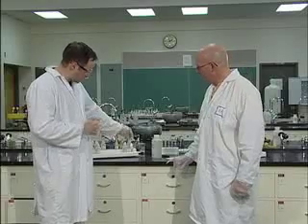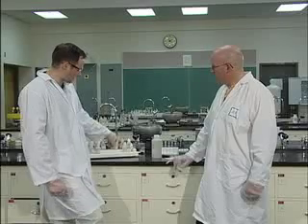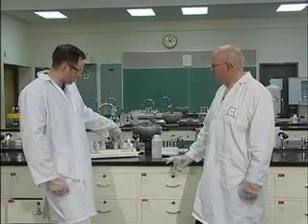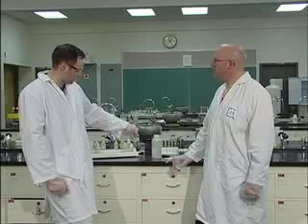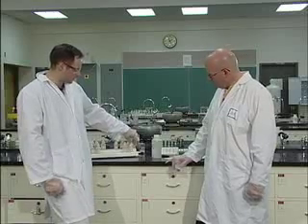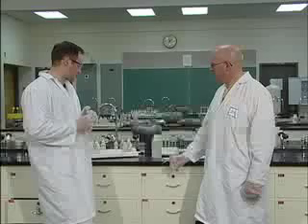You'll notice that all of your acids and bases are very high molarities. So we're talking 6 molar hydrochloric, 6 molar sulfuric, 3 molar nitric, which we're lucky that we even get to use. Okay, 6 molar sodium hydroxide and 6 molar ammonium hydroxide. So they're very high concentrations. They will hurt you if you get them on your skin. That's why the gloves are so important.